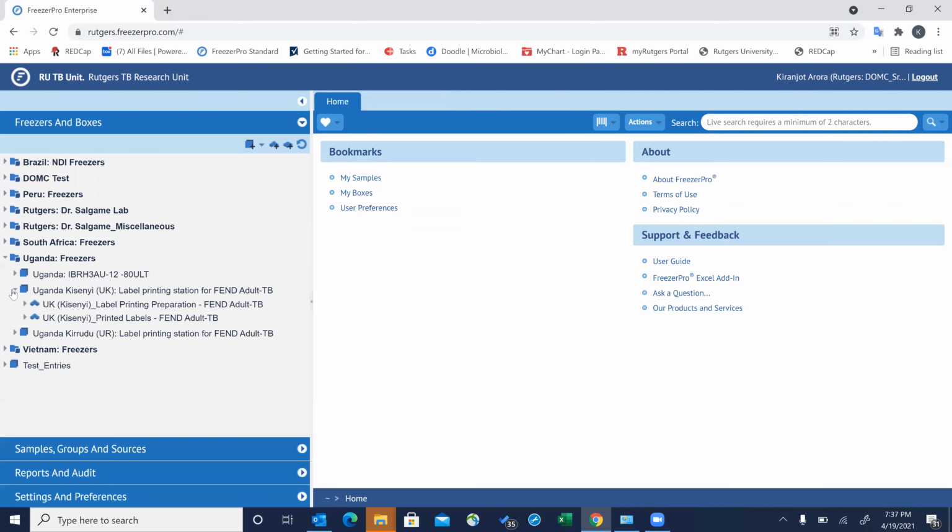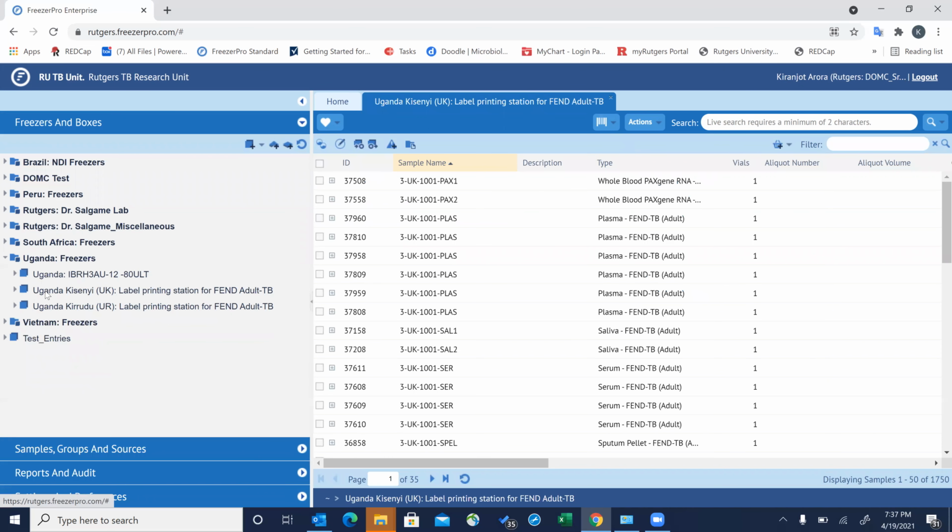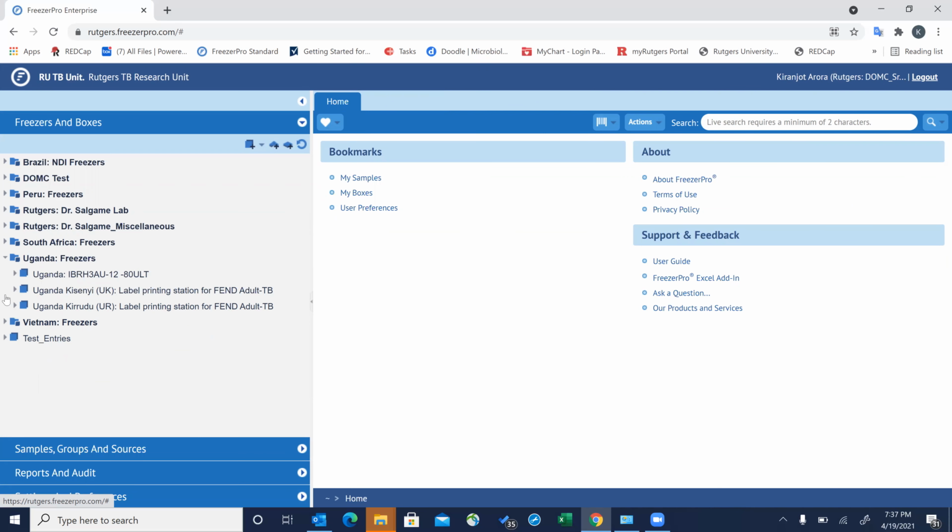All right, so when you click on the gray arrow over here, it's very important to click on the gray arrow and not double click or single click elsewhere, because the result would be different. So you see that right now you have an arrow mark in the place of the cursor, and the arrow is converted into a hand symbol when you bring it closer to the gray arrow mark over here.